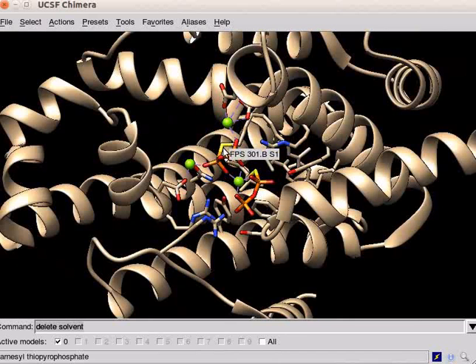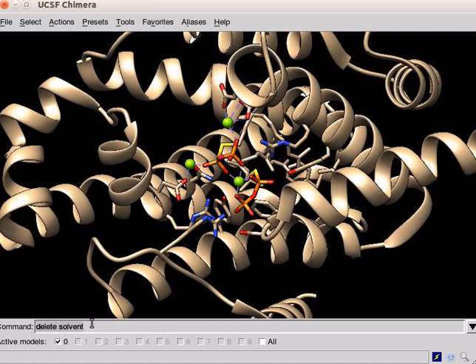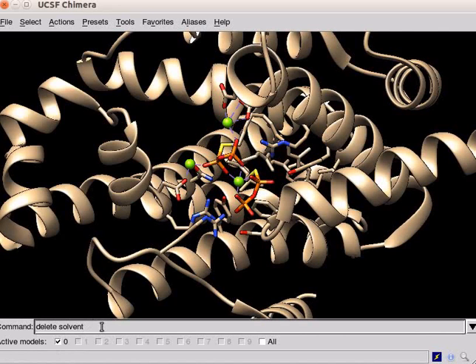We will superimpose two similar proteins to compare their secondary structures. For this, we will fetch a structure of the same enzyme without substrate. On the command line, type open space 2ZCO.